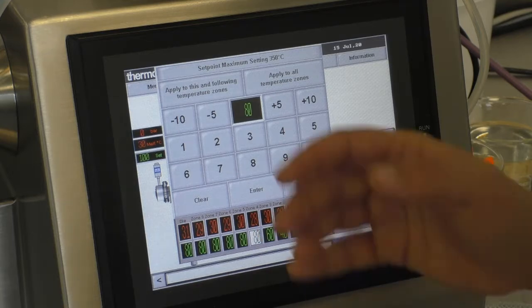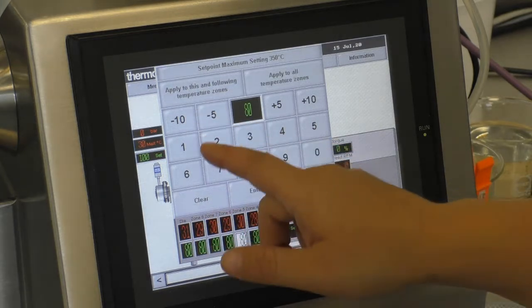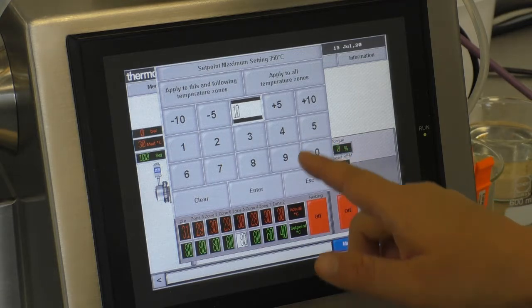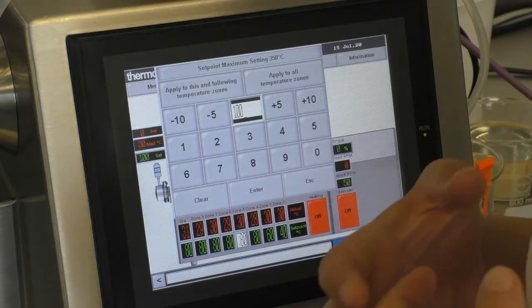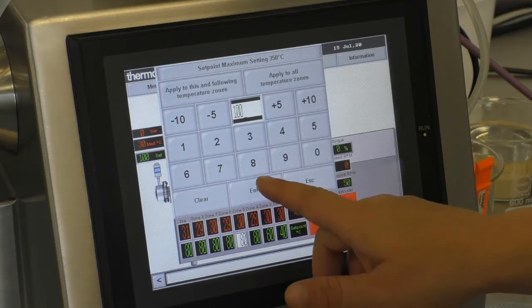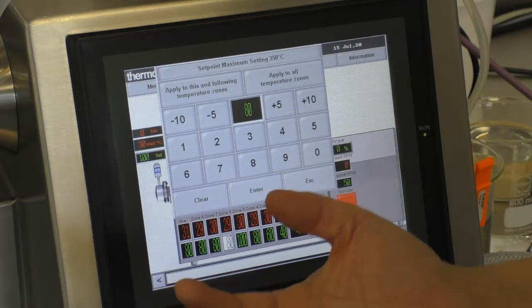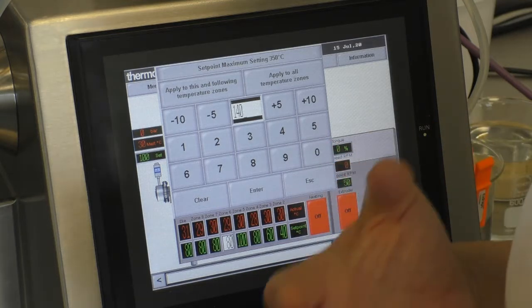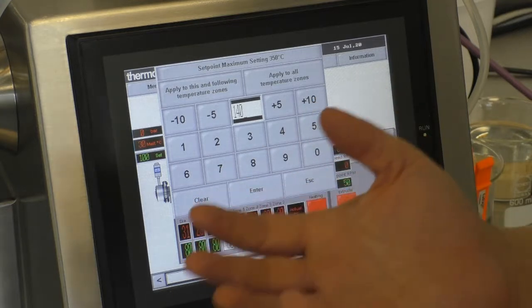And here in zone 4, I will start going up to 80 degrees, so I keep this temperature. And then I will go to 100 temperature, because we want to make sure that the material undergoes certain molecular changes, and for this we need a high temperature. And then for the rest of the extruder, I will set the temperature to 140 degrees Celsius, which is a temperature that we know for this material works very well and gives us a structure of the product that looks like a muscle meat-like product.